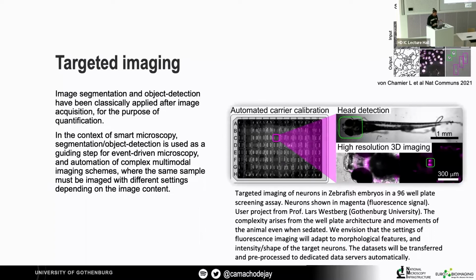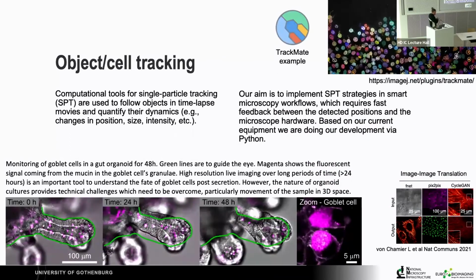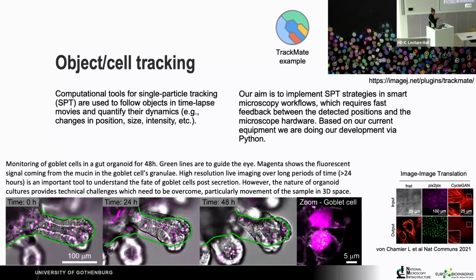And then what you might imagine is that one of the challenges is that even if the fish is sedated, sometimes it moves and it's very light sensitive. So actually, the more light I put on it, the fish might jump. So all of these things are things that we have to consider while we are working on this workflow, and that makes it very, very interesting also from, let's say, the difference between targeted imaging on a fixed sample versus a live sample.